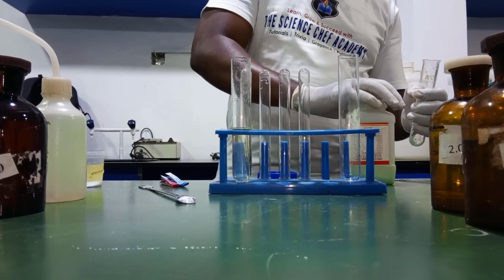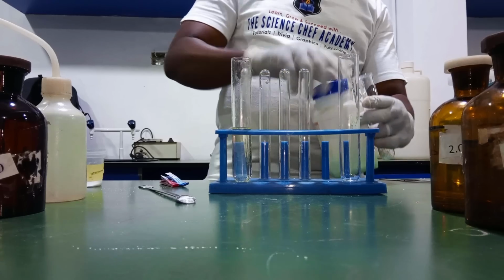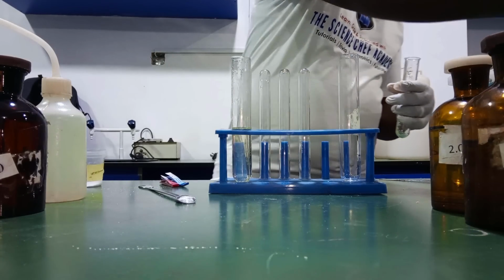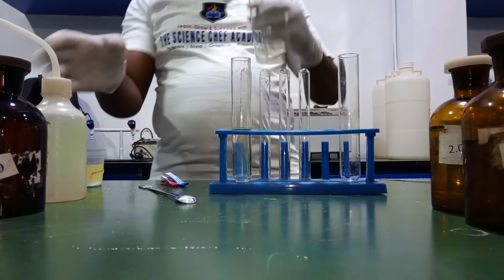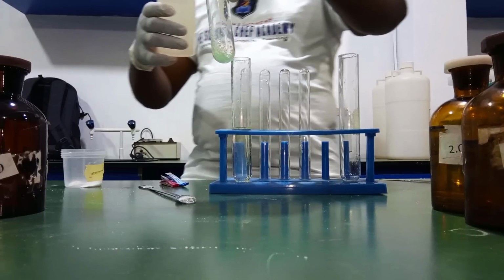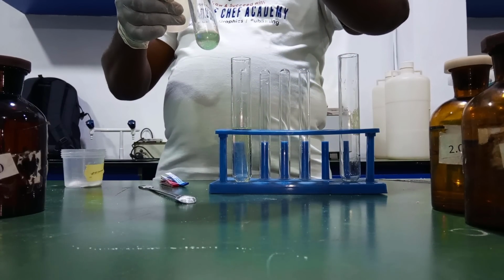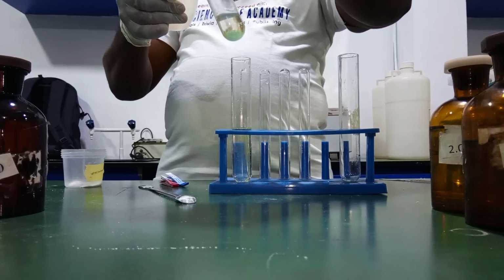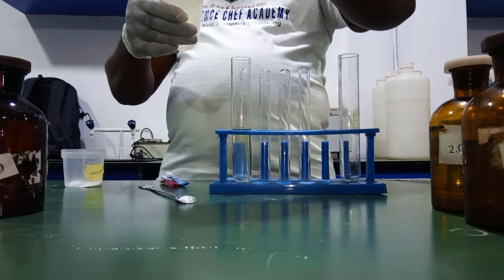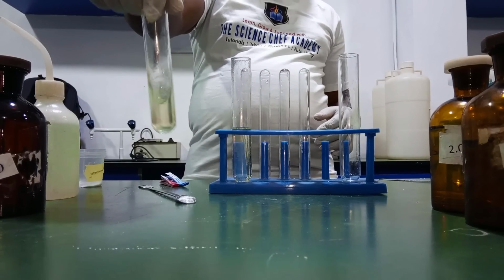Iron(II) is easily oxidized to iron(III). So that's why whenever you want to make use of an iron(II) salt in an experiment, it must always be freshly prepared. So you can see I'm preparing my iron(II) sulfate live and direct, to prevent oxidation to iron(III).